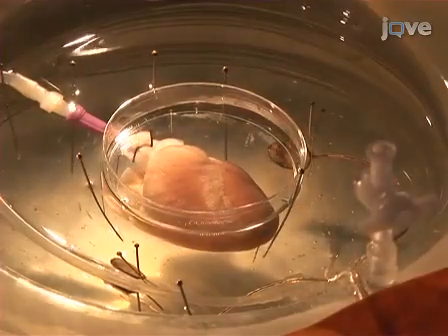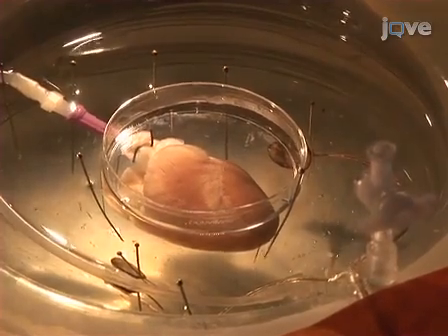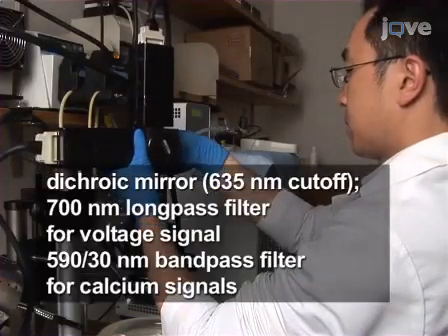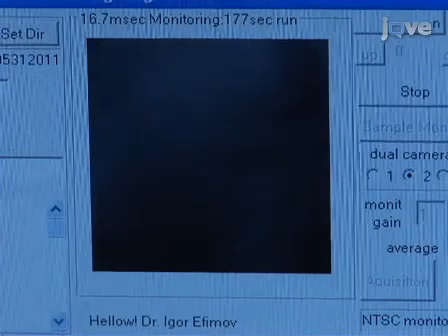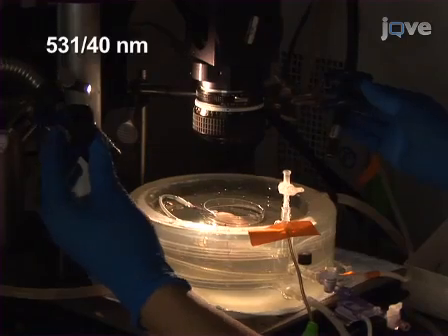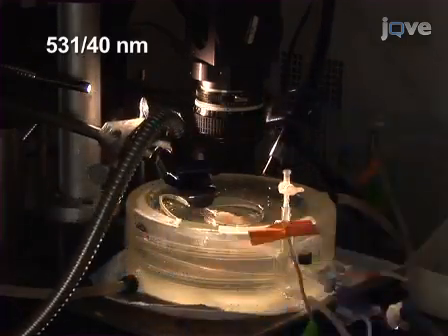This part of the procedure is normally done in the dark, but is being done in the light to improve the video image. Move the dual imaging system on top of the heart. Now, focus the two CMOS cameras on the same field of view. Next, position the light guides for two halogen lamps with excitation filter.